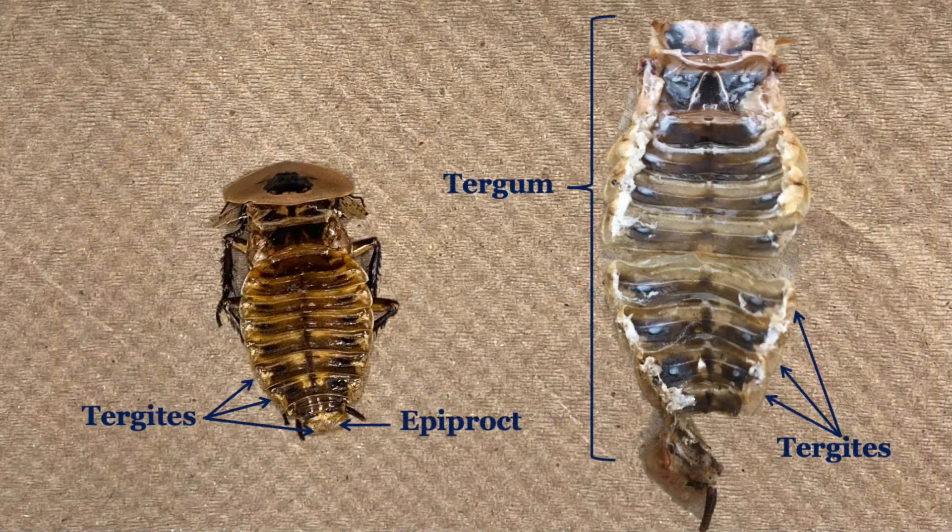Looking at a cockroach with the wings and pronotum removed, you can see the segments of the dorsal plate called the tergum. These segments are known as tergites, with the epiproct being the terminal tergite. On the right, you can see a tergum that has been separated from the rest of the cockroach.